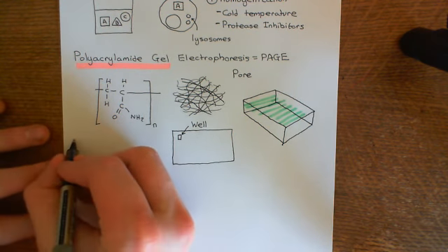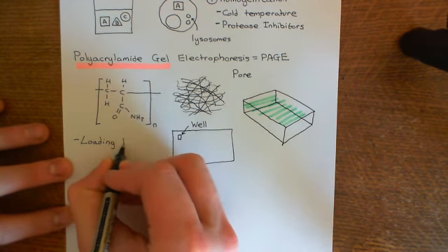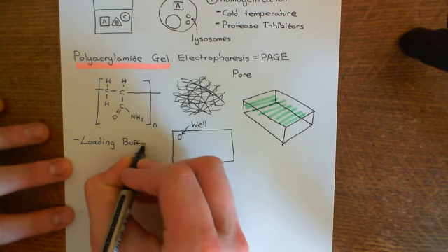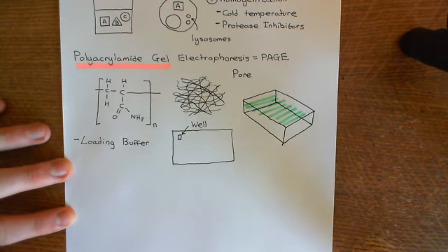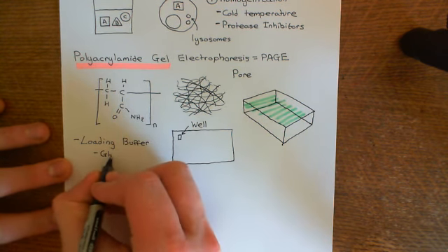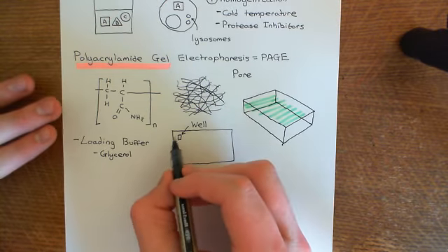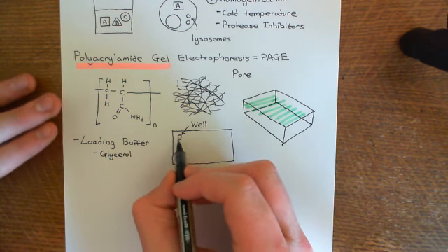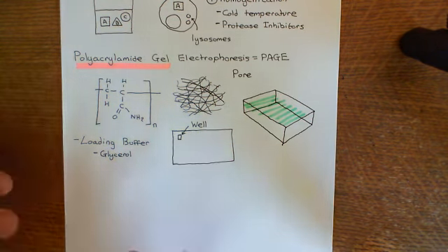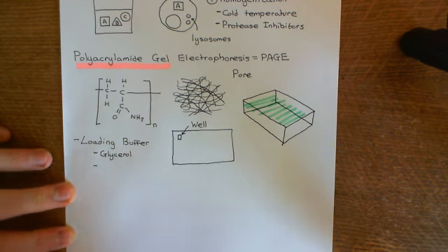So firstly let's have a talk about loading buffer. You're going to mix your mixture of proteins with a loading buffer, and this loading buffer will contain two important molecules. One of the things it will contain is glycerol. Glycerol is basically just a solvent, and it's just going to help the protein mixture to slip nicely into the well. It's just to help lubricate it in, and soak into the gel. Then the other thing it will contain is a tracking dye, and this is bromophenol blue generally.